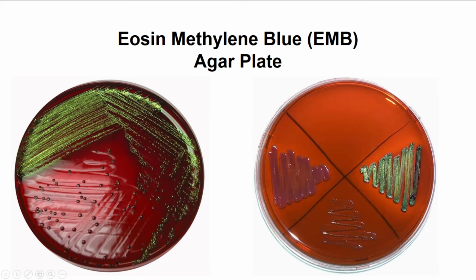You can see the other three results. This is a gram-positive organism, doesn't grow on here at all. A gram-negative, but non-lactose fermenter, so you can see it just kind of has that translucent bacteria color, doesn't really look like anything. A weak fermenter is kind of this dark maroon color, it's got that pink pigment. And lastly is the metallic green sheen you can see right there. Pretty easy to differentiate. Make sure that you're paying attention to these.